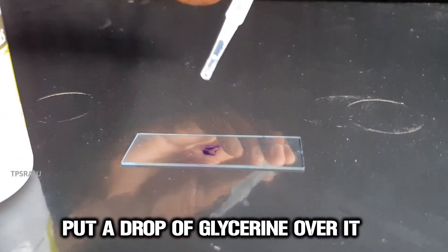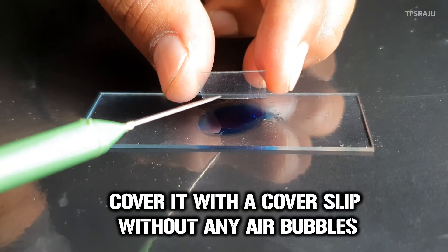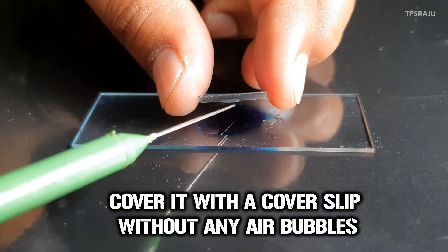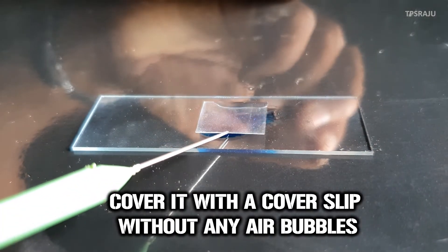Then, put a drop of glycerin on it. Next, cover it with a coverslip without any air bubbles.